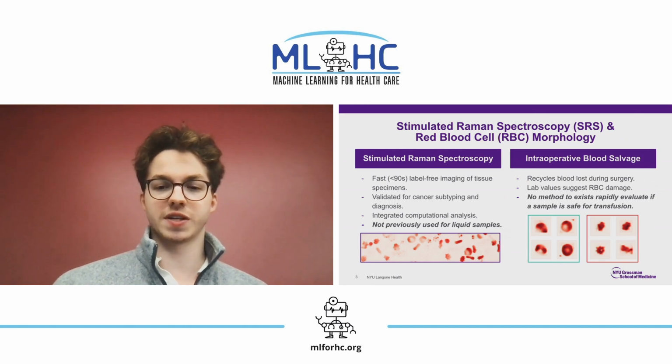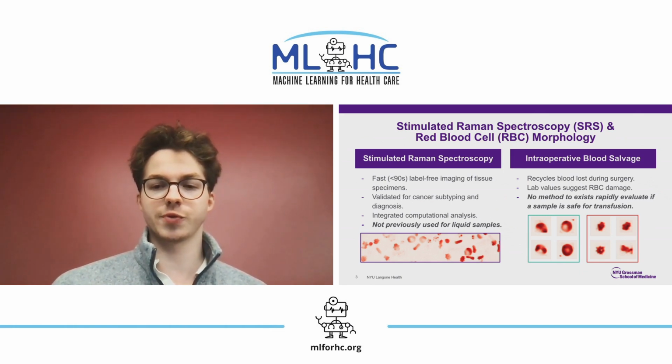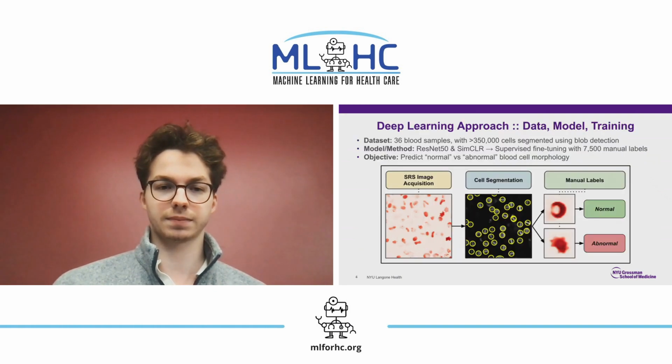Intraoperative blood salvage using a cell saver or other device recycles blood lost during surgery. However, lab values taken after surgery suggest red blood cells are damaged during the salvage process, and no assay exists to determine whether or not these samples are safe for transfusion.